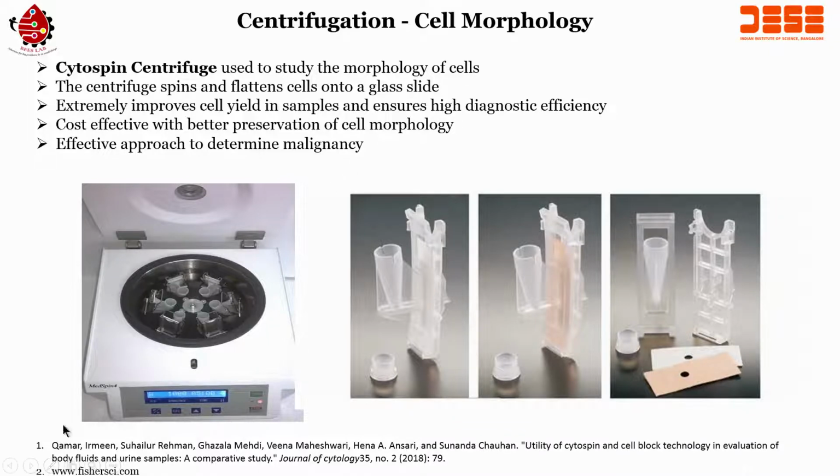Alright. So, we can see this particular cytospin centrifuge system, and we have the video for that as well, and then you can see here the loading system for the cells, and you will load the system in the cytospin so that you can load the glass slide here and the cells here.